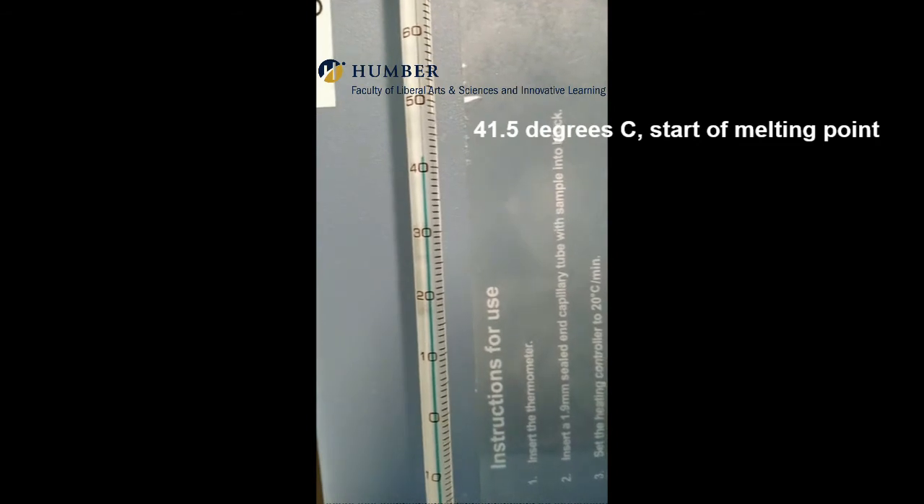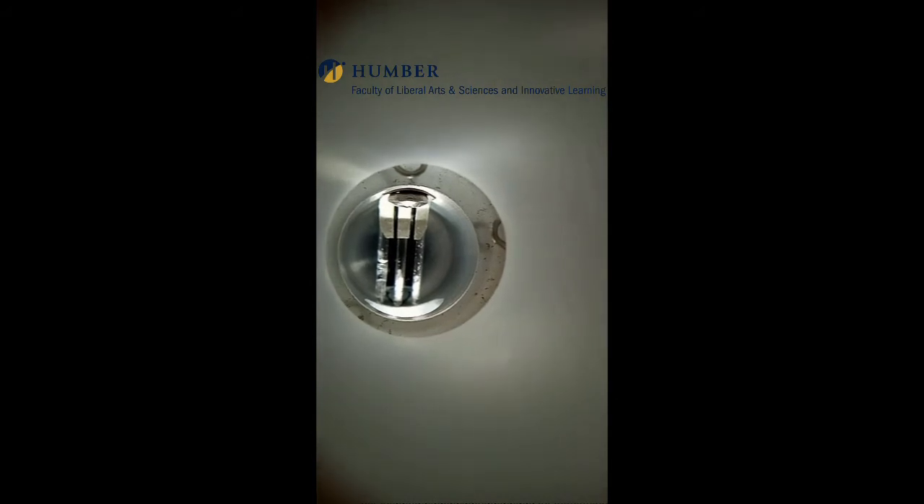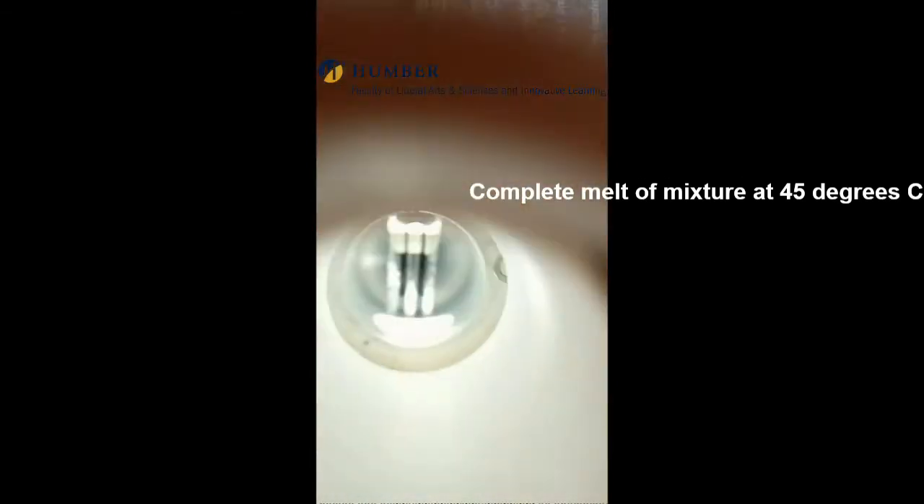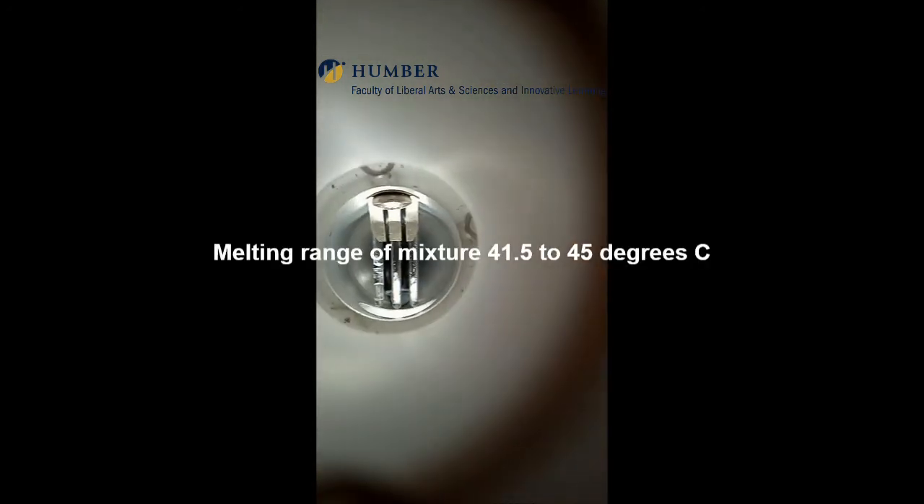The temperature is now 41.5 degrees centigrade and the melt is occurring. Complete melt occurs at 45 degrees centigrade, hence the melting range is between 41.5 degrees to 45 degrees centigrade for the mixture.